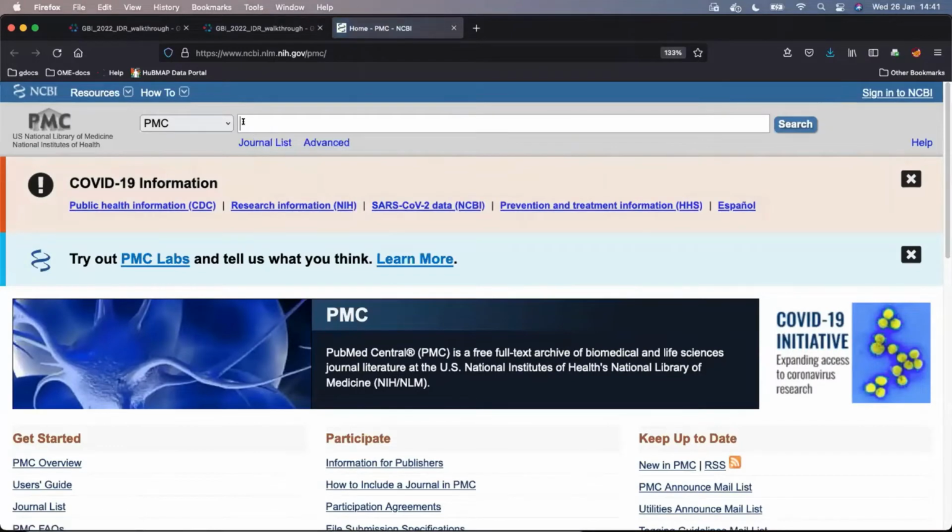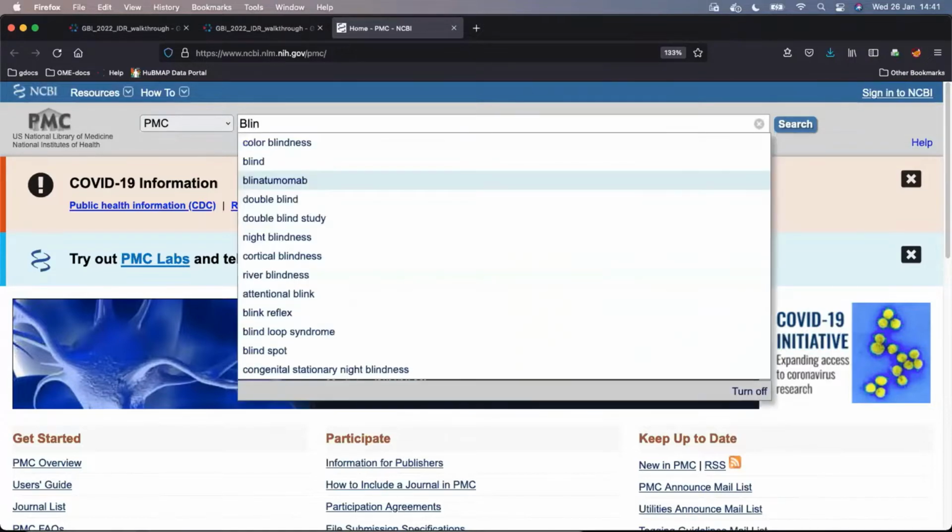or you can simply search Google for PMC in your Google browser, and you should land here in this searching page, which you very possibly know from your scientific career, where you are simply trying to find a journal in some publication from author X. Okay, and my authors X names I know now are Blin, which is the first author of the publication, and then Lowell, which is the last author. It's a publication from Sally Lowell's lab here in Edinburgh. I mean, we are in Dundee, but by here I mean here in Scotland.